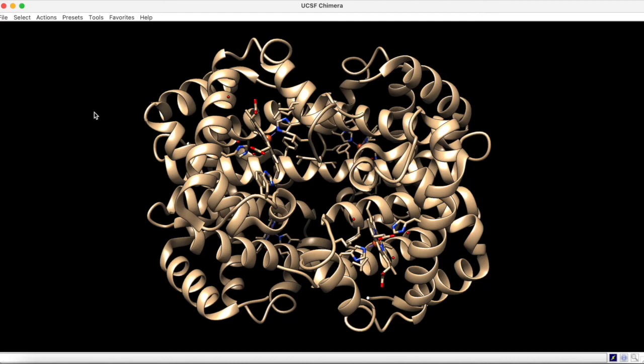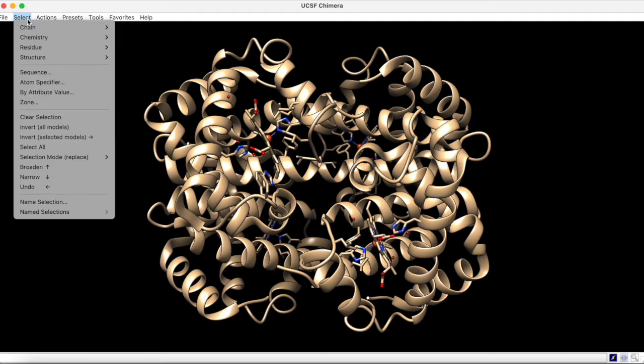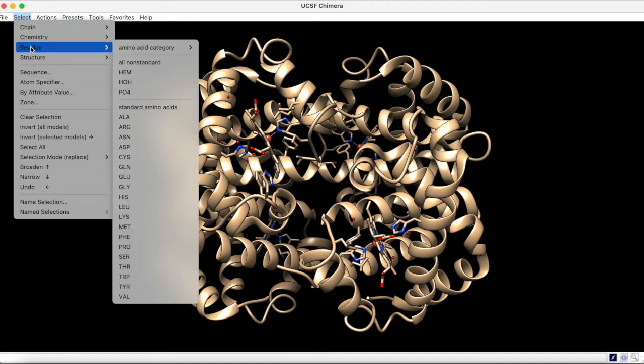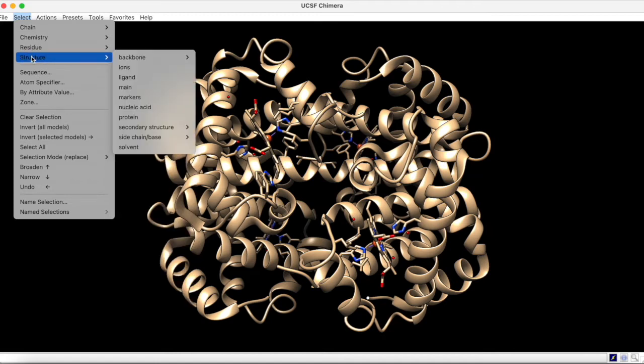One of the most important functions to understand when using Chimera is selections. Under the Select menu, you can select parts of the protein according to chain ID, specific chemistries, residue type, and other structural features.